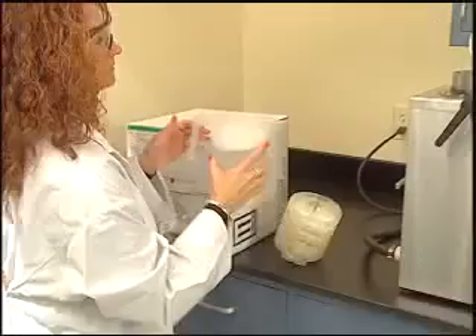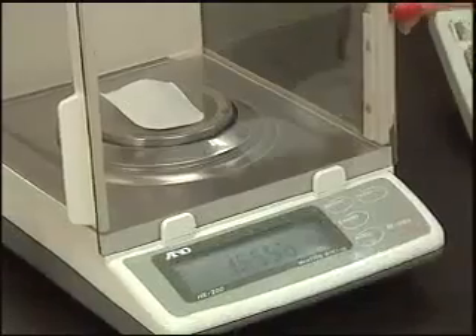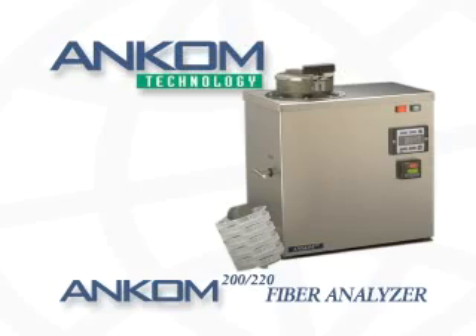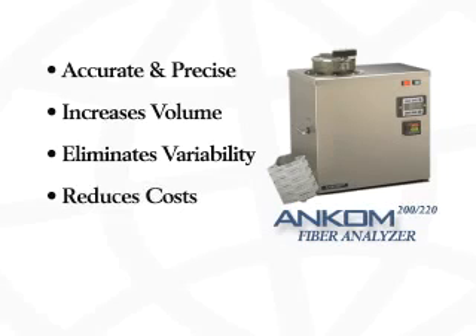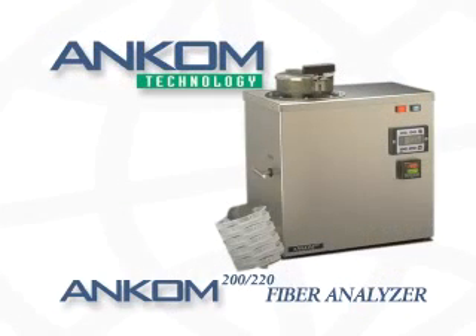It's that simple. One technician, 24 samples, precise and accurate results. To summarize, the ANCOM fiber analyzer provides accurate and precise results, increases sample throughput, eliminates technician variability, and reduces overall costs. The ANCOM fiber analyzer will make your laboratory more efficient and economical.